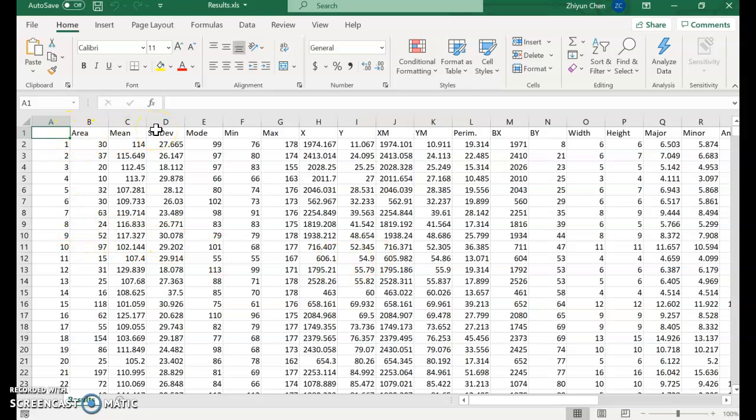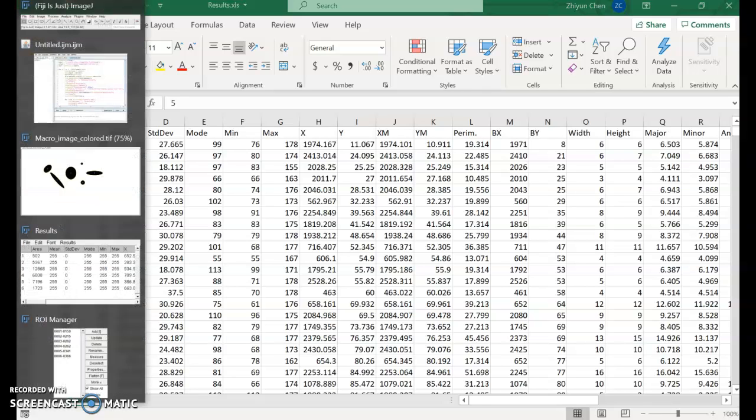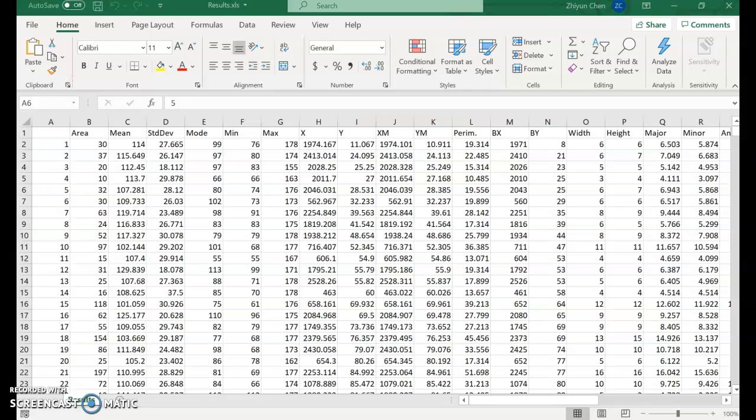And we can further filter out some unwanted particles by setting up a threshold on one or more particular parameters. But we need Nikita and her professor's help to make sure that our selection makes sense from the forensic science point of view.